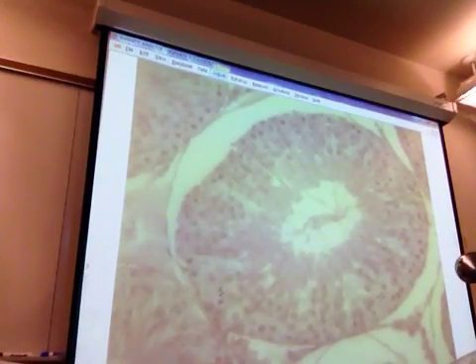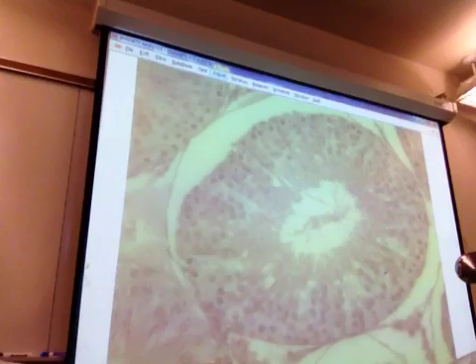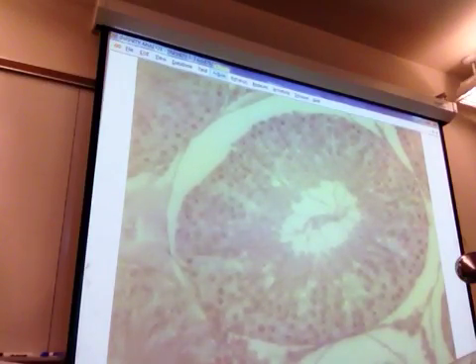So what's this one? That looks like a spermatogonium. Yes, which is a stem cell. And this? Primary. Okay, good. What about this one? Probably a secondary, but primary too. And this one? Spermatogonium. What about that one? Nurse cell. Okay. So don't be fooled. Make sure that you can follow them all up, because the nurse cell nuclei do look a lot like the spermatogonium nuclei.